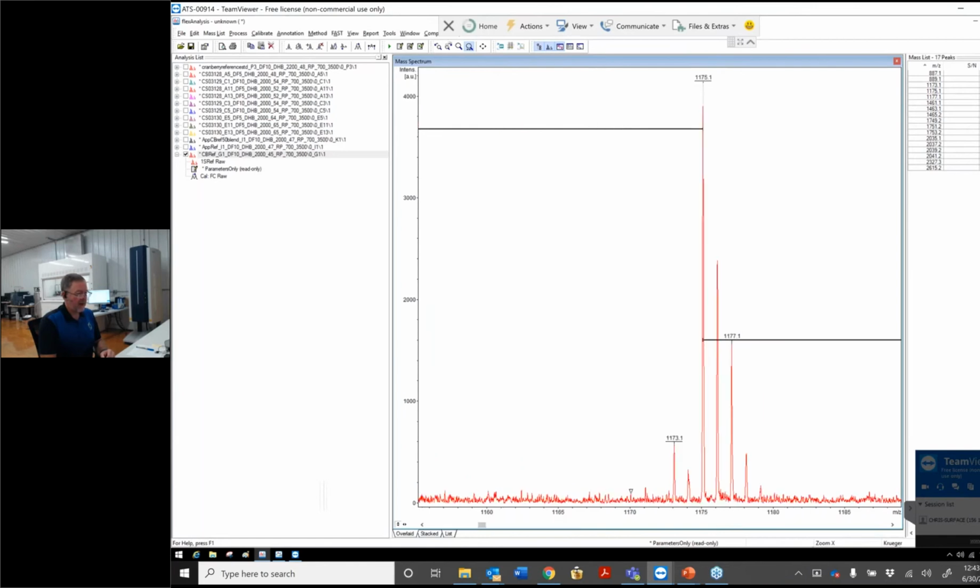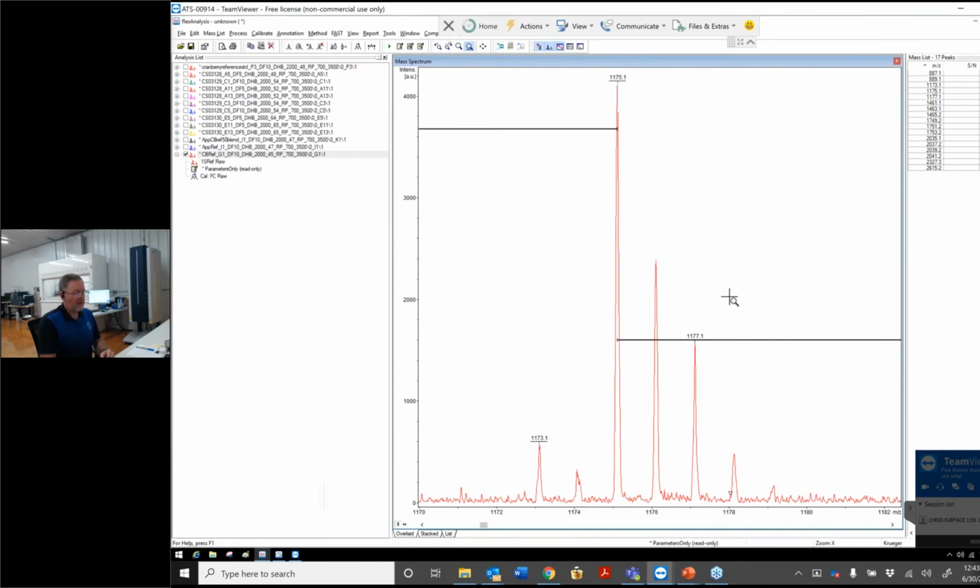If we zoom in on this tetramer, we will see that we have a complex series of overlapping isotope patterns. We have a procyanidin trimer in which all the interflavan linkages are B-type, a tetramer in which there's a single A-type linkage, again 2 atomic mass unit differences, the loss of 2 hydrogen and the formation of that bond, and a compound in which we have 2 A-type linkages, so the loss of an additional 2 hydrogen. This represents the unique fingerprint or profile of a Cranberry procyanidin tetramer.